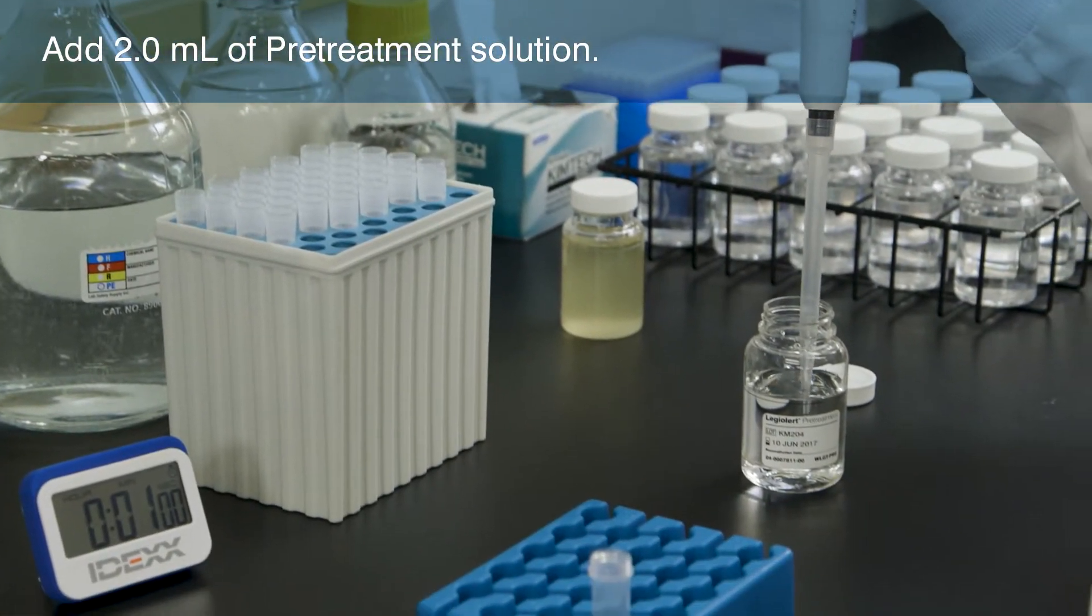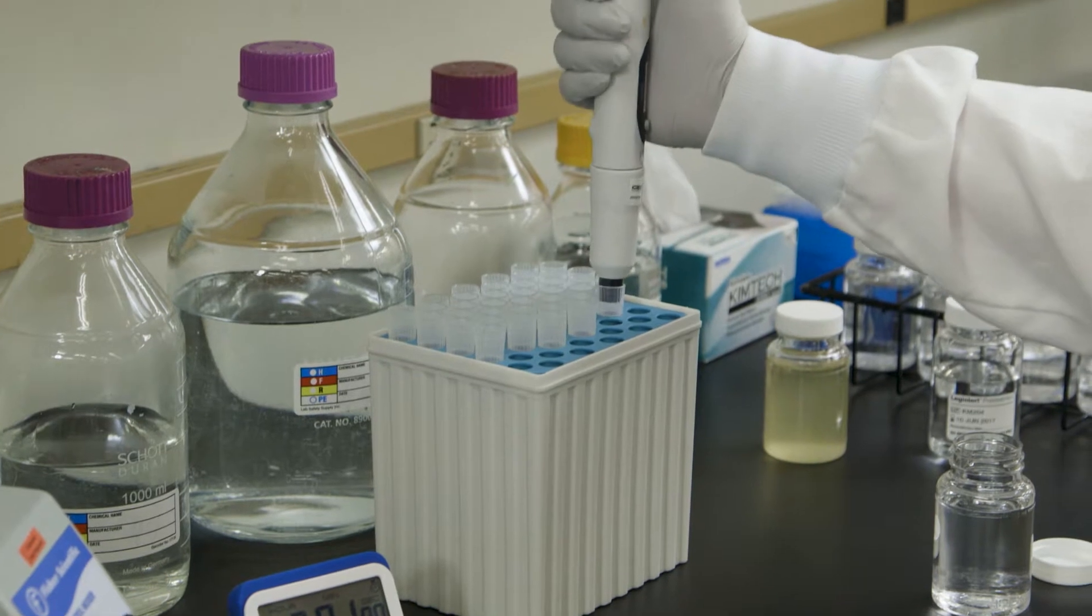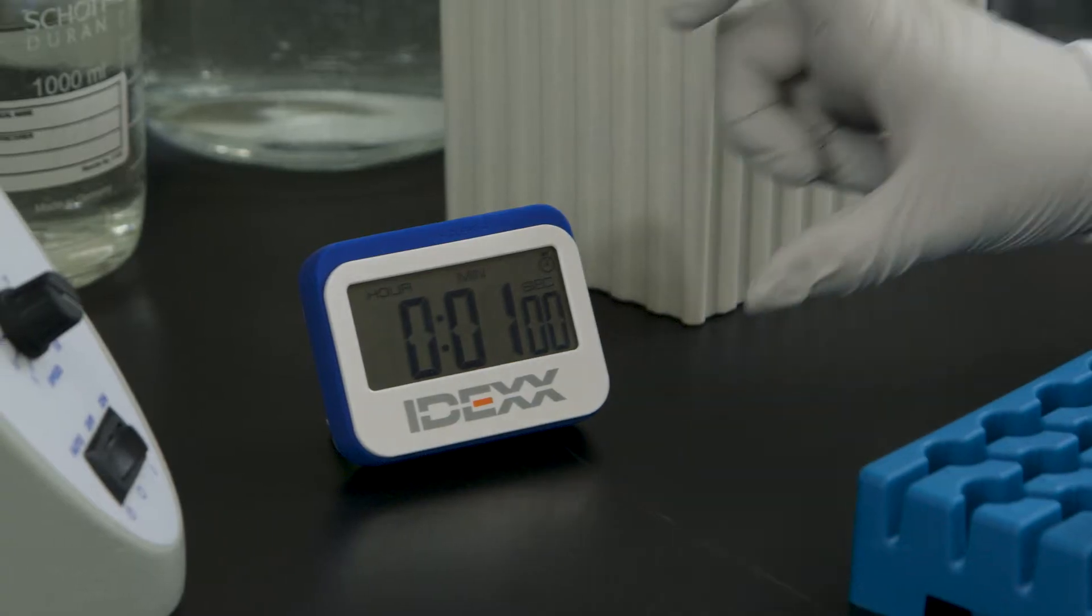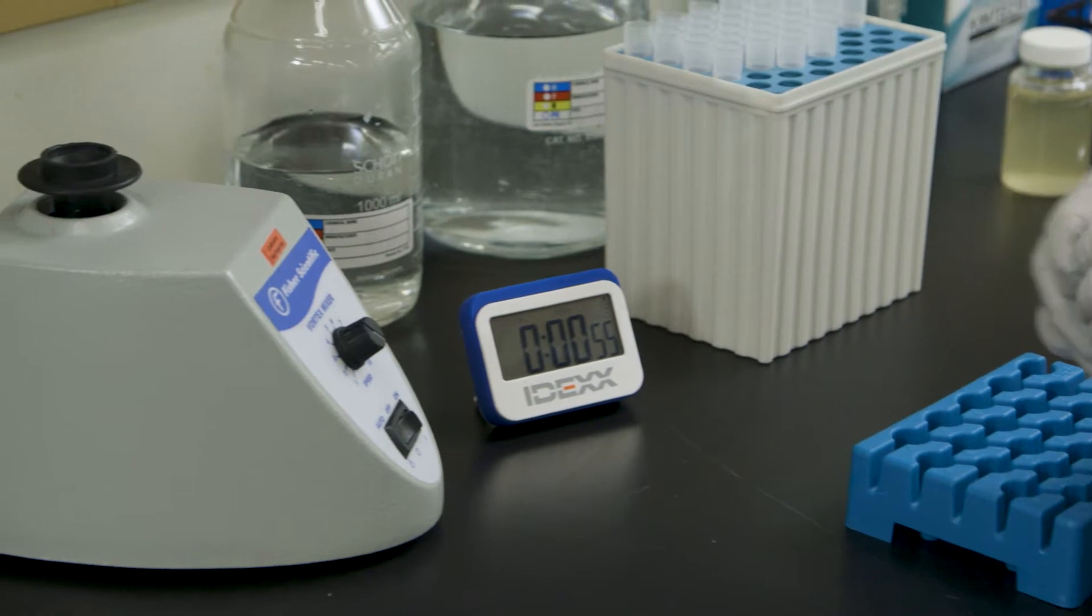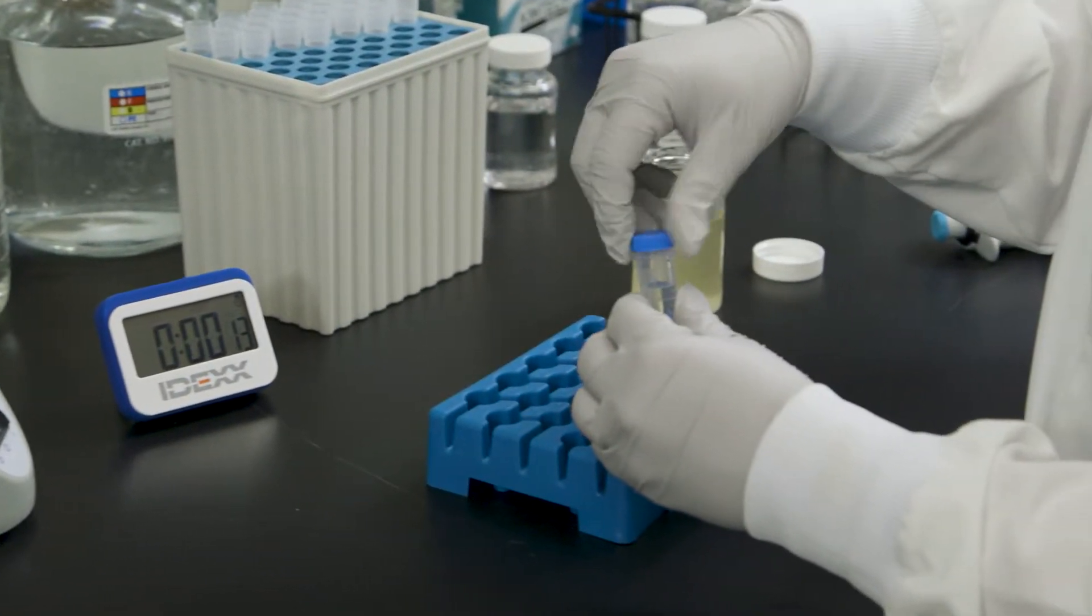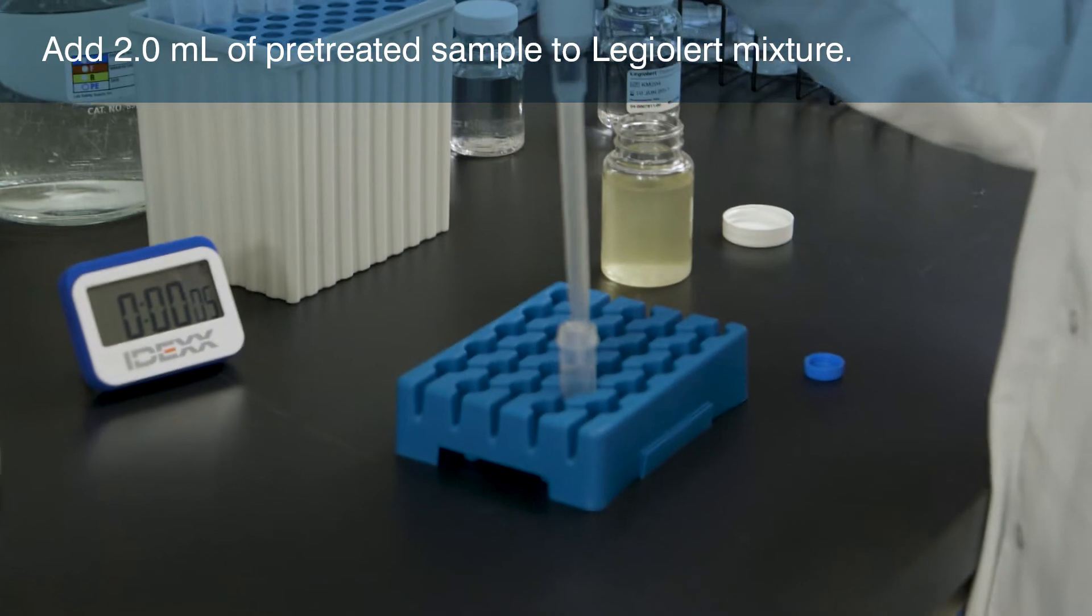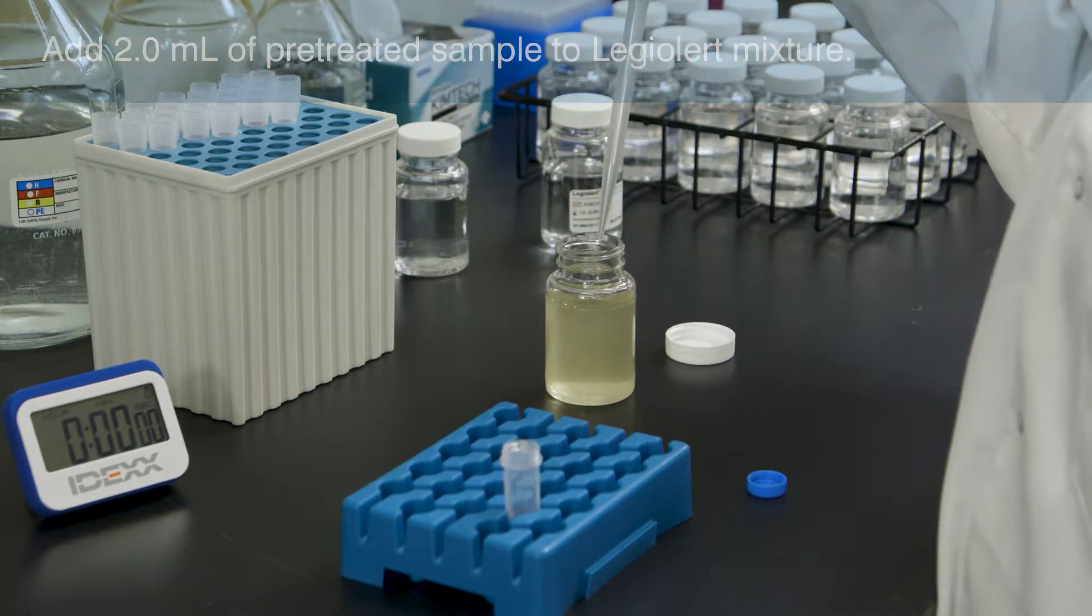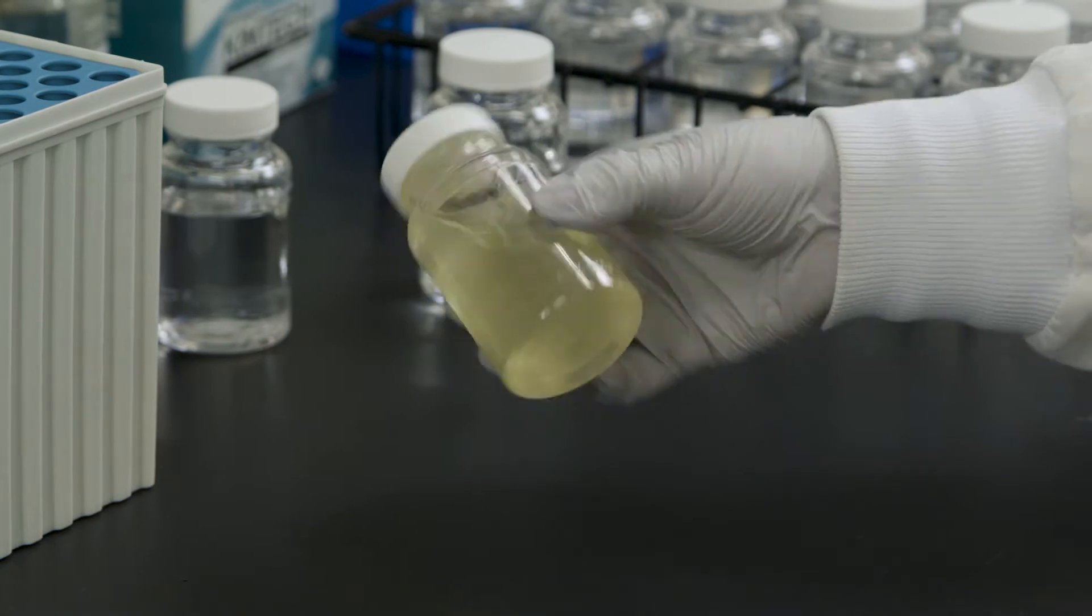Add 2 mL of reconstituted LEGALERT pretreatment to a sterile tube. Add 2 mL of non-potable water sample to the same tube. Start a 1-minute timer and then mix the contents thoroughly. Mix again before the 1 minute is up. At 1 minute, immediately transfer 2 mL of the treated sample to the vessel containing the dissolved LEGALERT reagent. Cap the vessel and invert to mix the sample with the reagent. This non-potable water sample is now ready to be quantified.